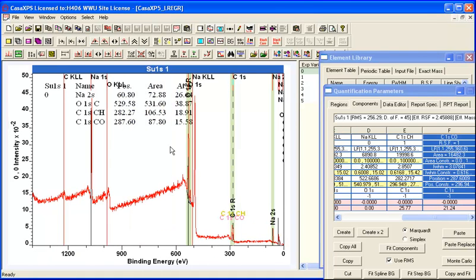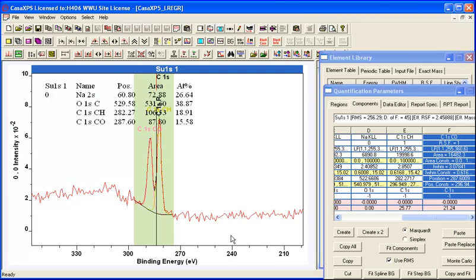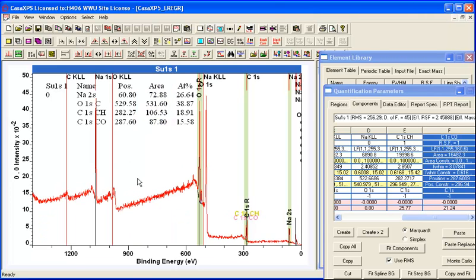So having observed that I've got something along these lines, I might go back to my original calculation and look more closely at the component that I chose for this, where I saw a pair of peaks like this, and I would like to see whether I can get some spectral form that would look more like what I'm anticipating based on this rough quantification here, and then calculate, if I assume that, the other spectral forms and see if I can get a self-consistent answer.